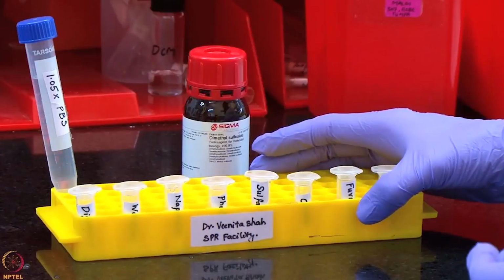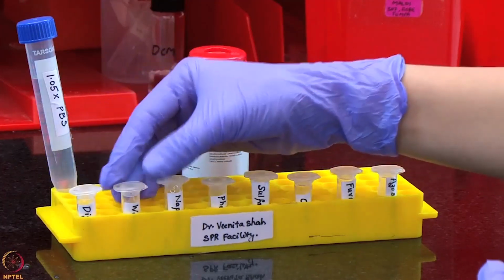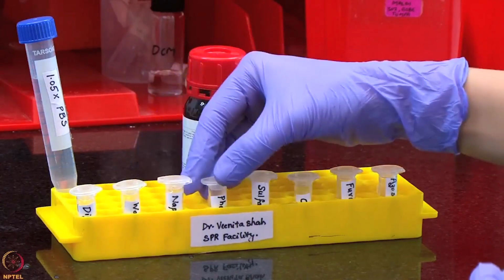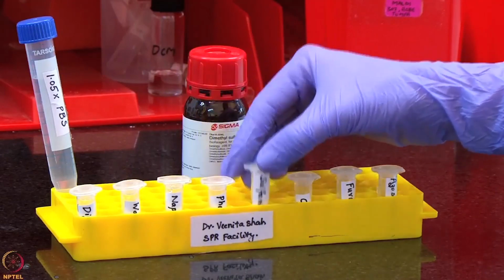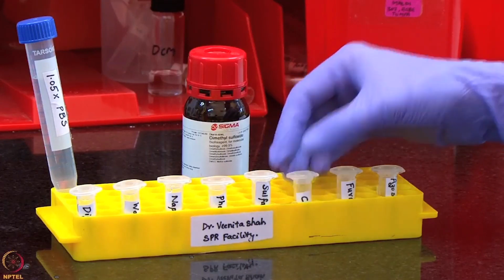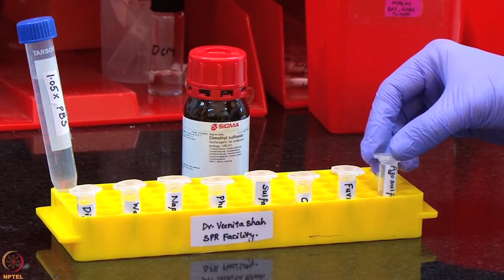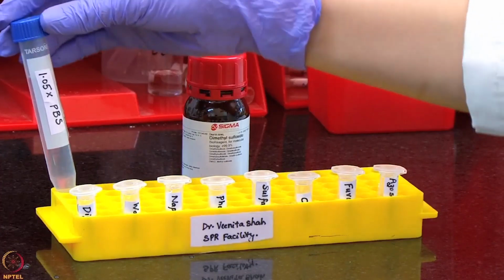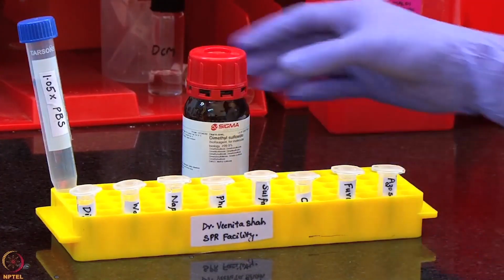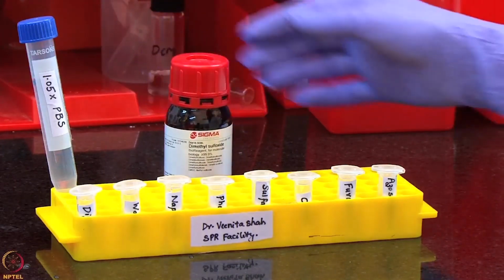We will be preparing all small molecule samples including digitoxin, warfarin, naproxen, phenytoin, sulfanilamide, carboxybenzene sulfonamide, furosemide and azosulfamide from 1.05x PBS and 10 millimolar stock solutions of these drug molecules using DMSO solution according to the tables shown here.